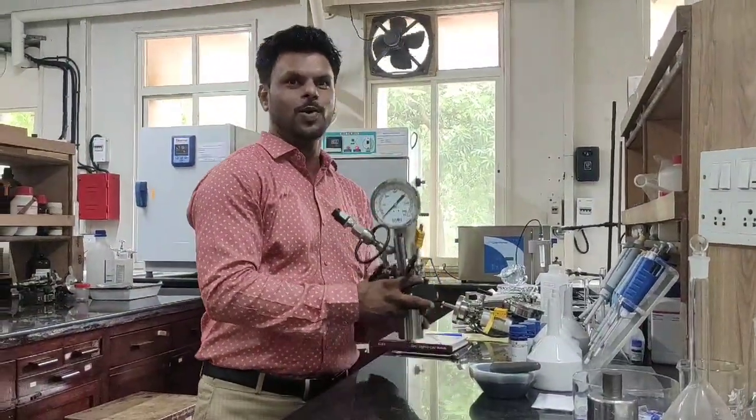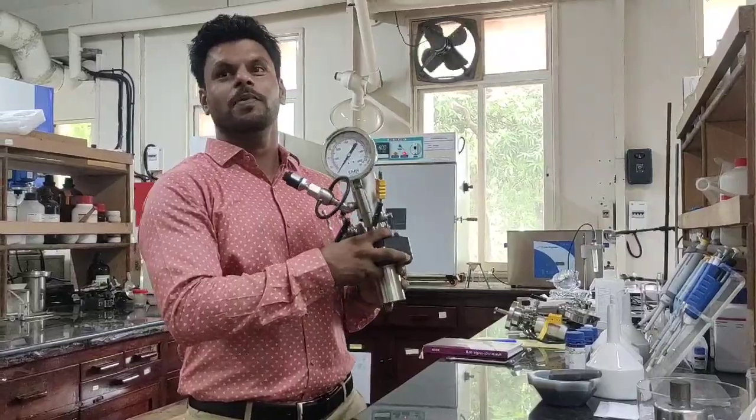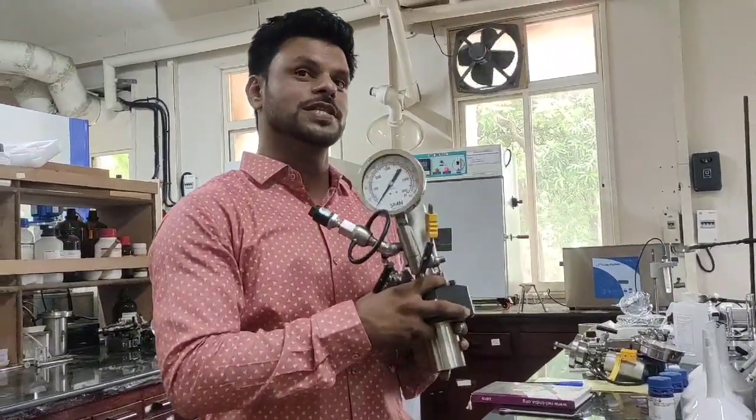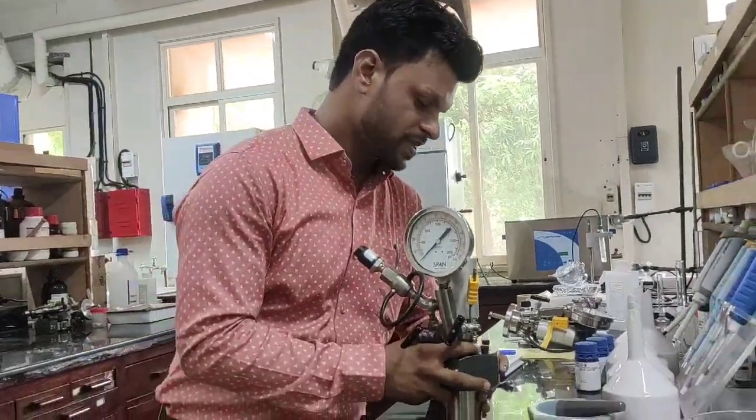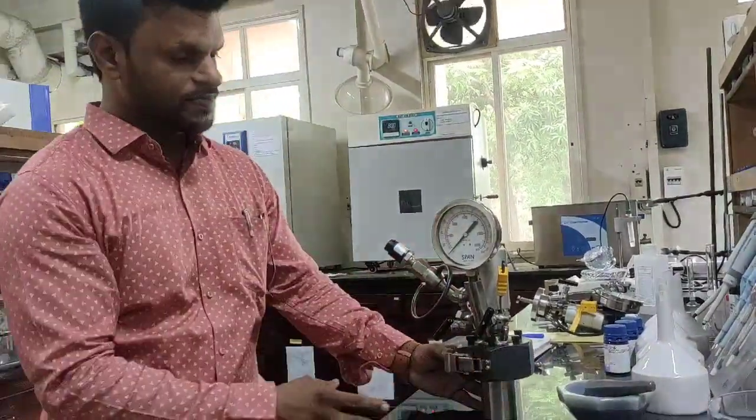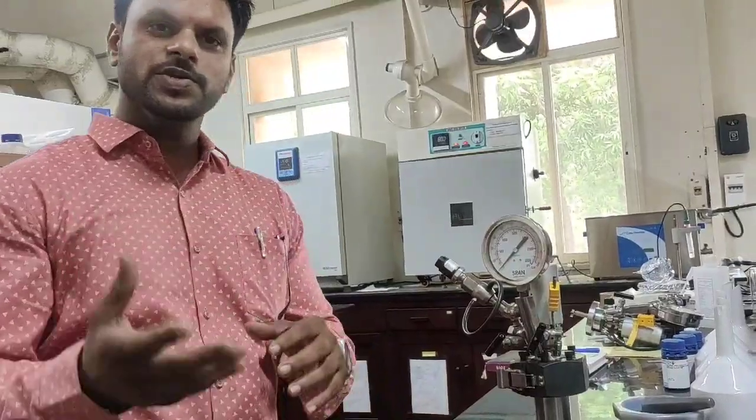The thing here I am holding in my hand is called a power reactor and you will be amazed to listen to the price, this will be nearly 5 to 10 lakh rupees per piece. Now the question is why we use power reactors.